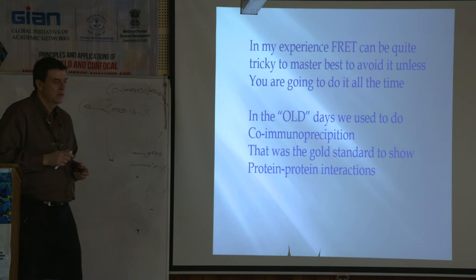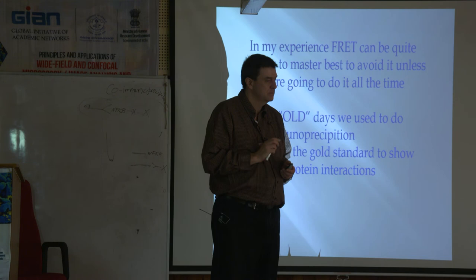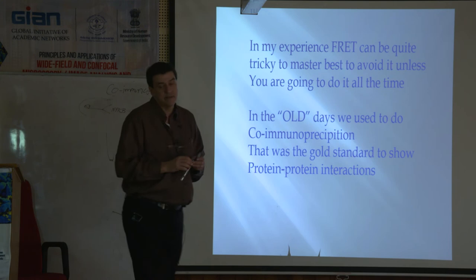The what? Histone interactions. Which are? Oh, okay. Oh, I think you could. You probably could set up a FRET system to see if those interact or not. Is that what you're asking? Yeah, I think basically any two proteins, you could set up some kind of system like this to try to make it work.